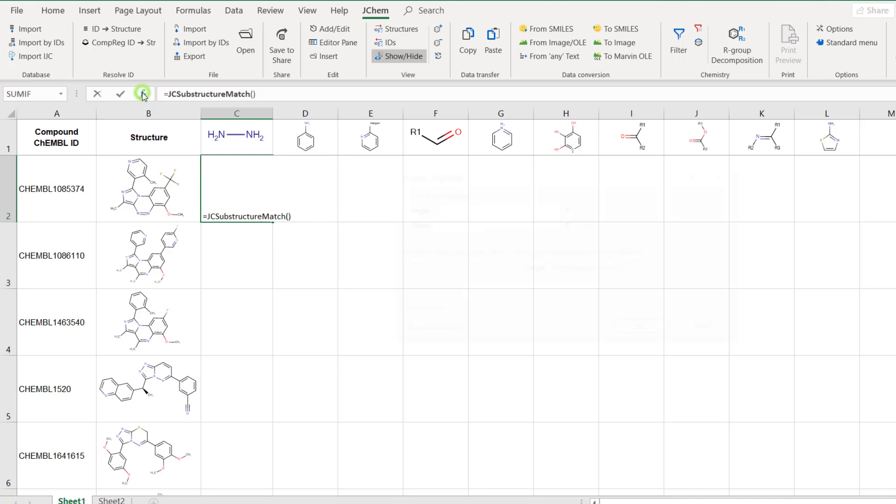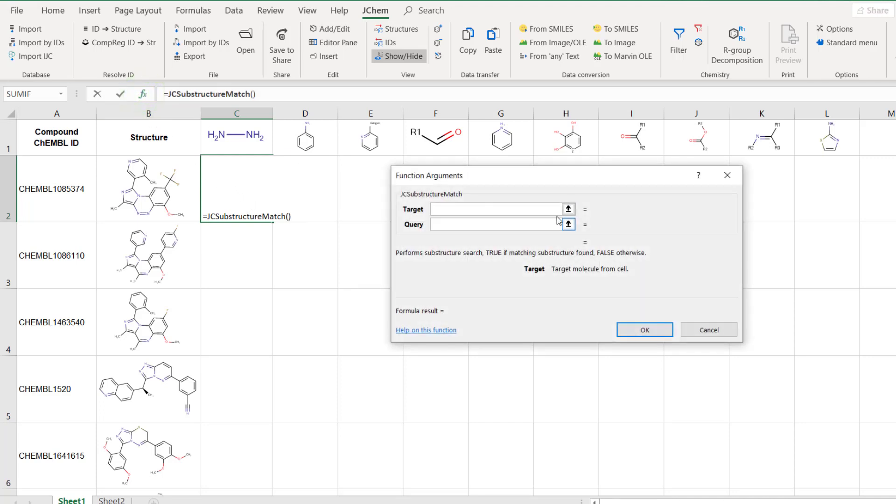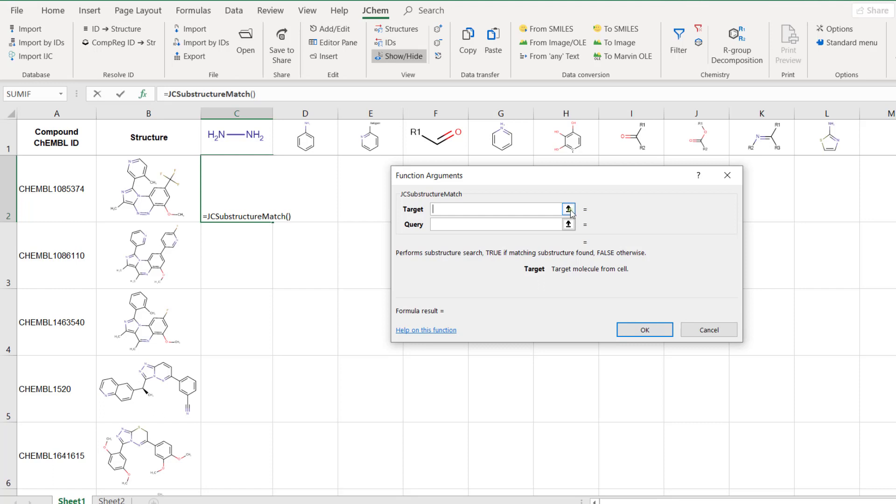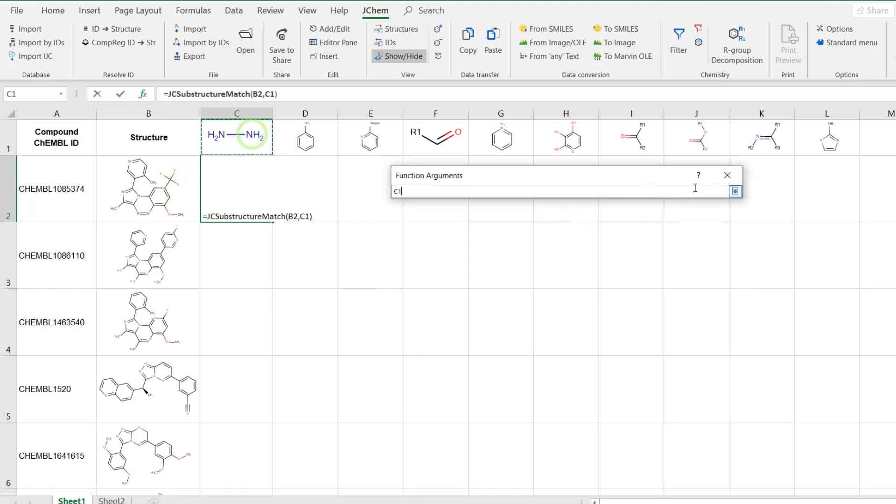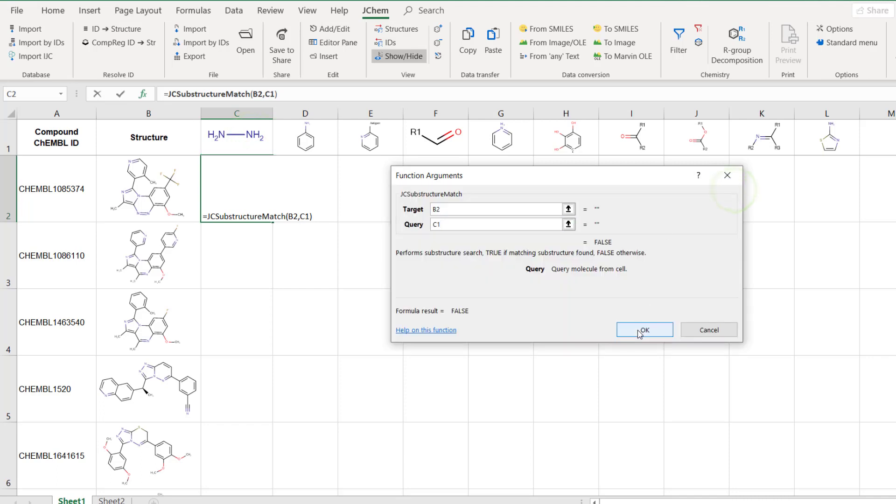The function requires two parameters, the target compound as first and the query structure as second. With this the formula is ready for the first check.